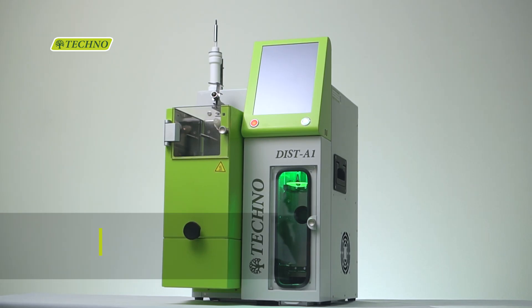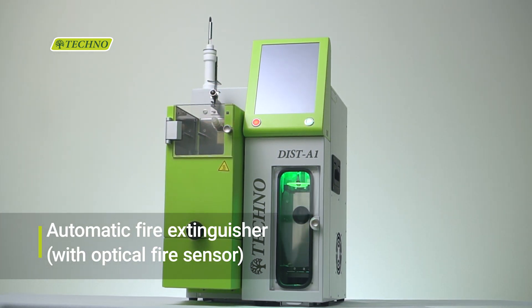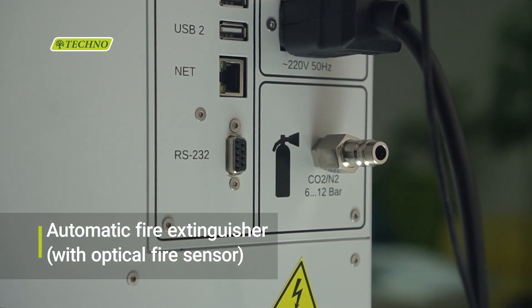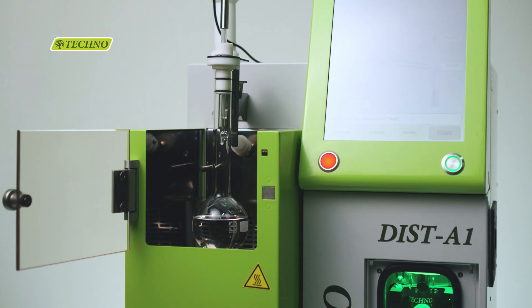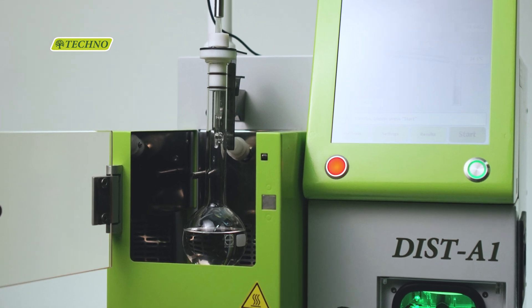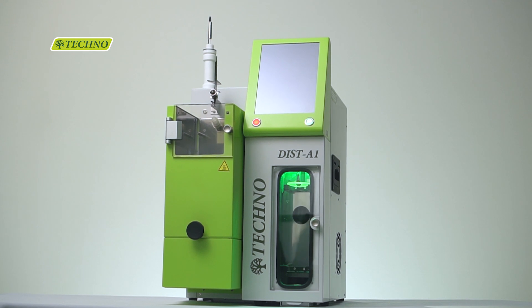The DIST-A1 conforms to the highest standard of safety in its class. It features an automatic fire extinguishing system for a completely safe experience. In case of an emergency, it automatically supplies inert gas in the heating chamber and efficiently quenches the area of a possible fire.